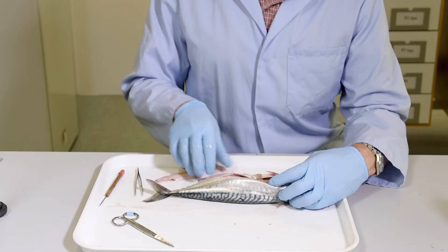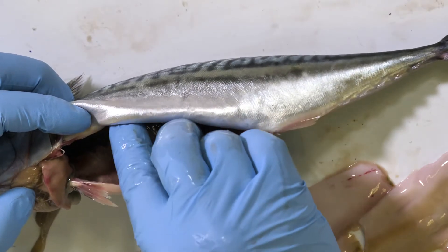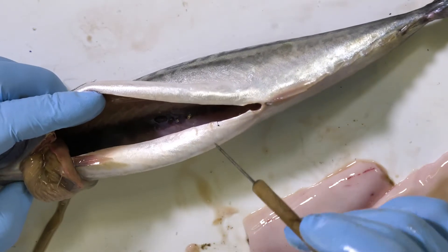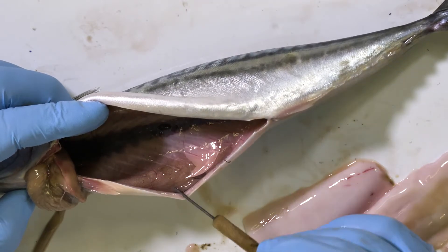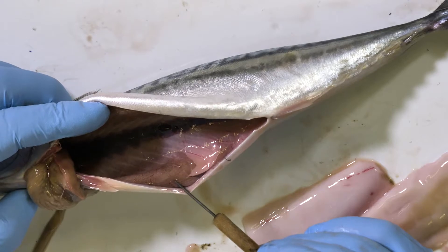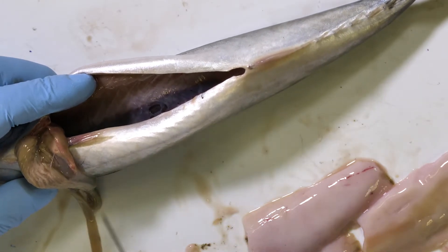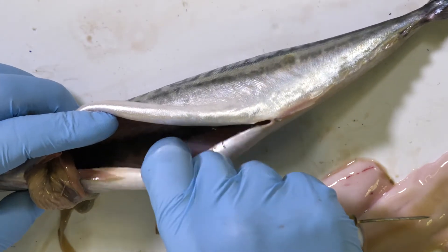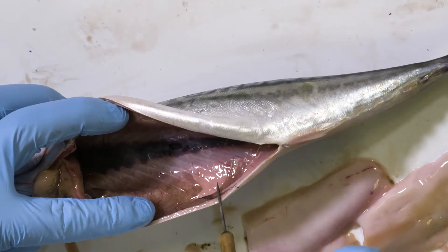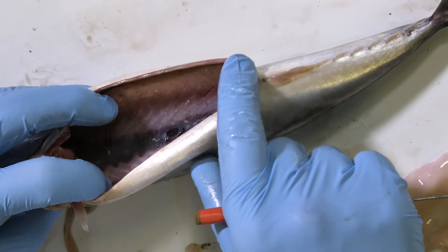Now that I've removed the gonads from this mackerel and separated the gut from the anal region of the fish, I can move all of the main structures away from the body cavity and begin to inspect the body cavity and the surface of the gut for Anisakis worms. These worms are often alive in a fish that has been relatively recently killed, and that makes it easier to spot them. They can be a centimeter or so long — thread-like worms — and the most likely place to find them is on the surface of the gut, on the surface of other organs in the body cavity, or on the inner surface of the body cavity itself.